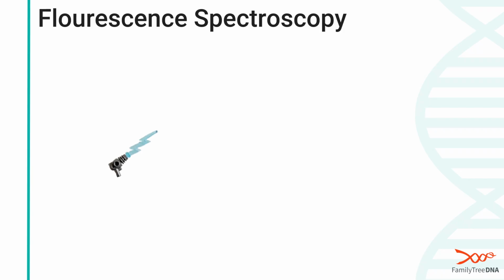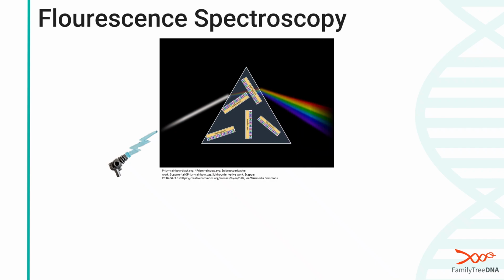So here is an accurate real world version of that energy source that they use in the lab. It is in fact a Lego ray gun. And then they shine it onto all the DNA segments that you have. So you go pew, pew, pew. And then because the energy is exciting those different nucleotides, you're going to get A, C, T, and G that are going to fluoresce in different colors.